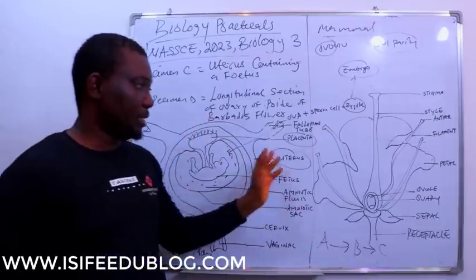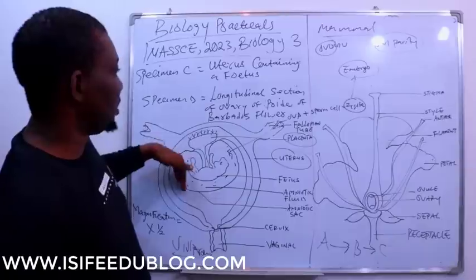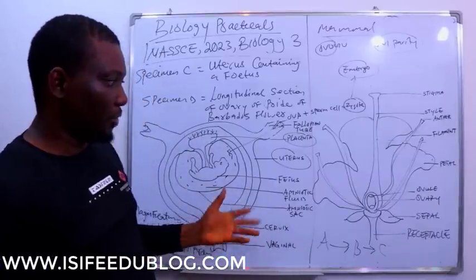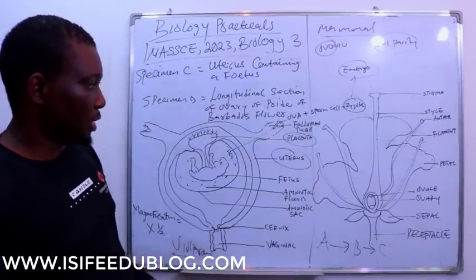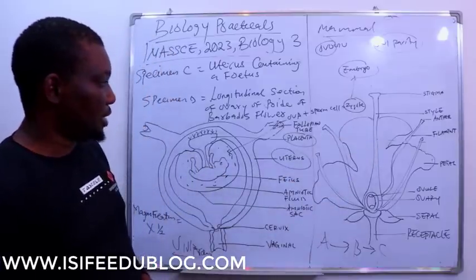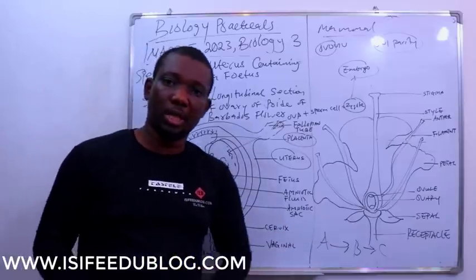Specimen D is quite different from this specimen, so I don't think we will have any basis of comparison. But if there's any comparison, we'll also mention that. So this is specimen C. Specimen D. Make sure you learn all these diagrams, because you don't know the actual diagram.